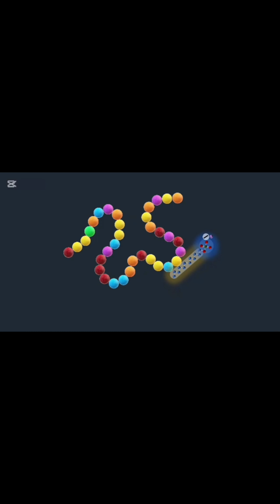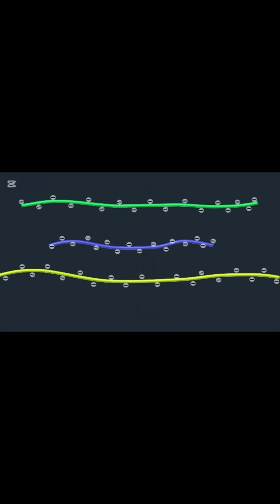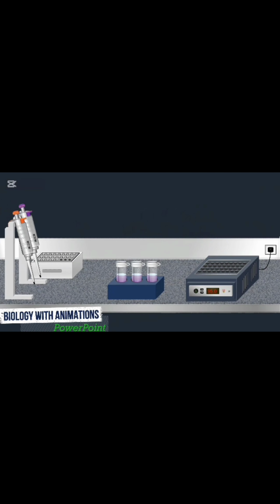Also, when a protein mixture is heated, the SDS binds firmly to the protein, and the intrinsic charges of the protein become negligible when compared to the negative charges contributed by the SDS. This treatment brings the folded proteins down to linear molecules with a uniform negative charge, therefore these proteins can be separated in a polyacrylamide gel based on their molecular weight.